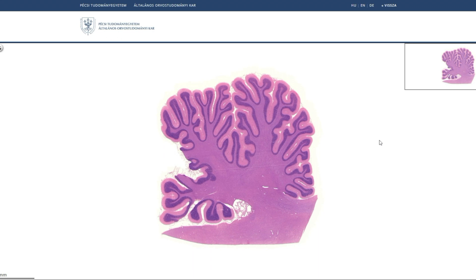The first slide is the cerebellum with hematoxylin and eosin staining. With this magnification you can see the convolutions of the cerebellum, which are called folium and not gyrus. In the center of each folium you see a slightly paler area — this is the lamina alba, which is white matter, surrounded by three-layer gray matter. The white matter towards the center of the cerebellum increases in size and is coupled to the underlying brainstem via one of the cerebellar peduncles.